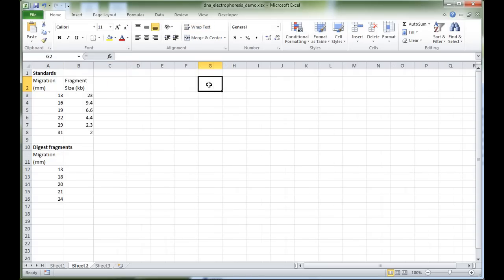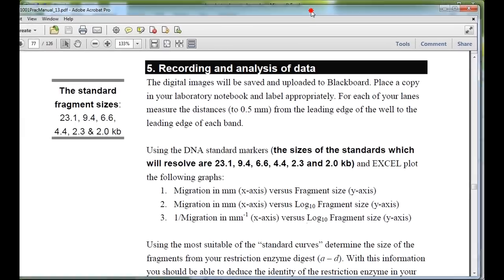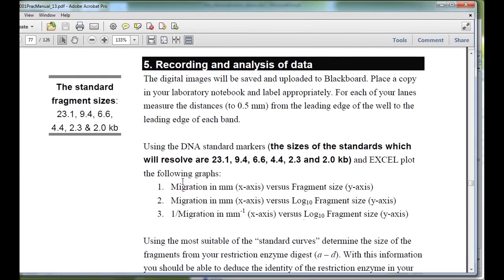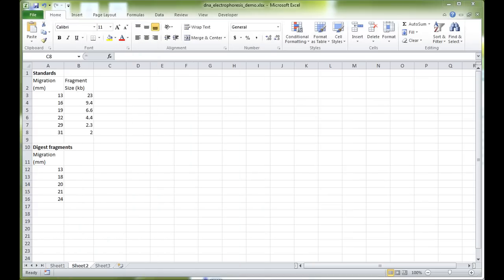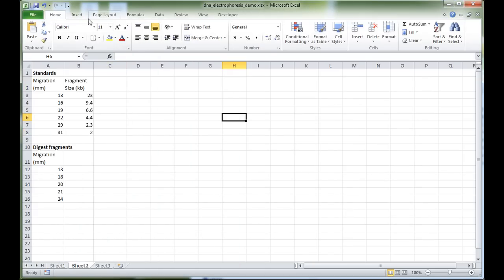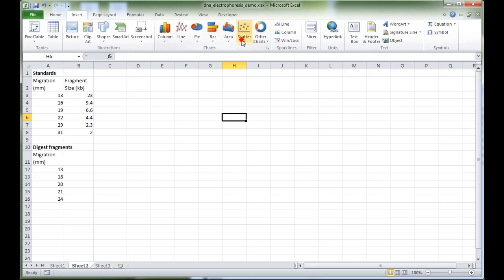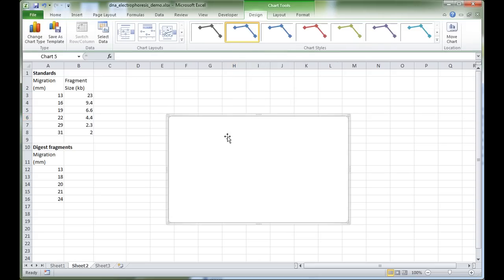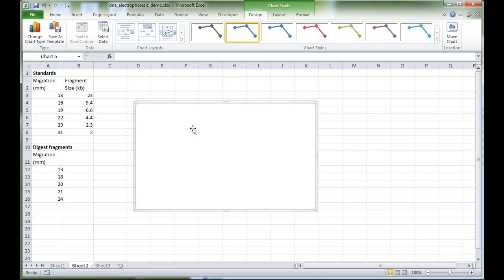Now we need to construct a set of standard curves to relate these mathematical values. According to the lab manual, we should draw three standard curves: the first has migration on the x-axis and fragment size on the y-axis. We'll insert a blank XY scatter chart — Insert > Scatter — which allows us to customize the type of data we put into the graph.